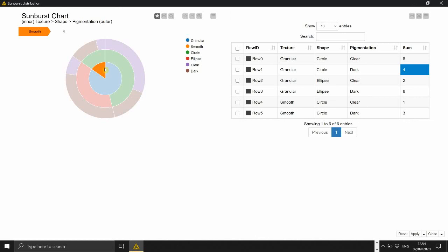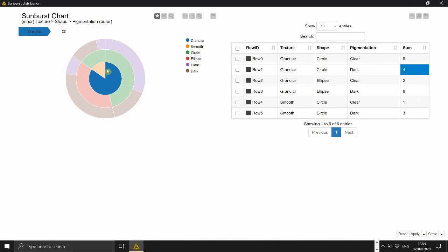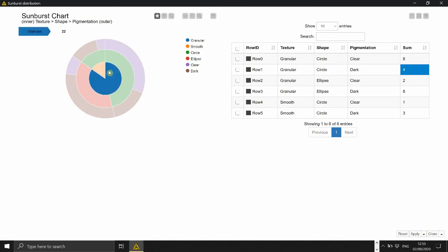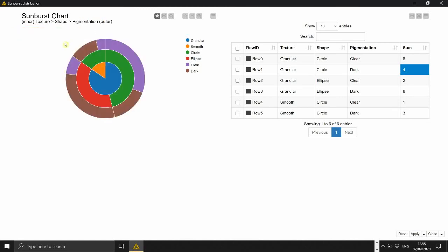So there is one circle per feature and so each level gives you the distribution for this particular feature. So basically let's say you forget about the two outer circle and we just focus on the first circle. It's just like a pie chart and then it gives you the distribution for the first feature which is the texture.